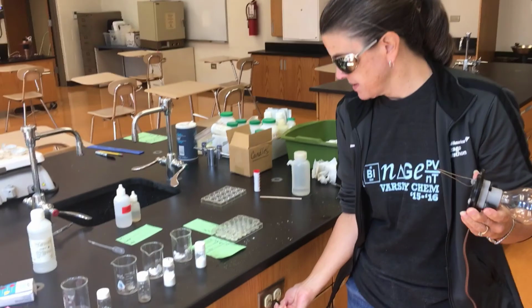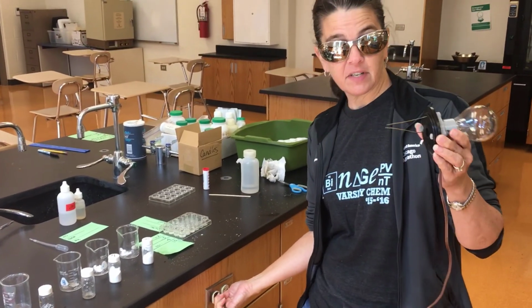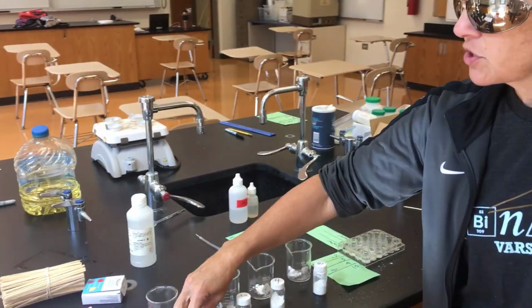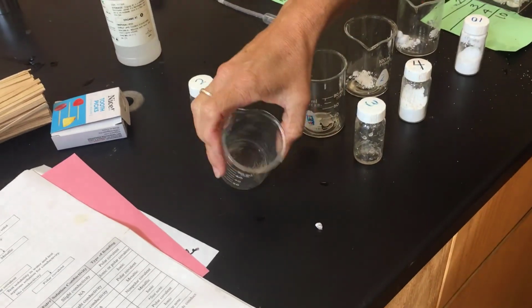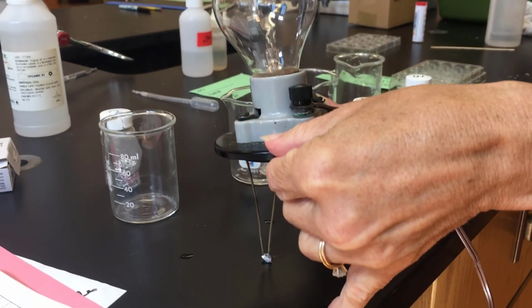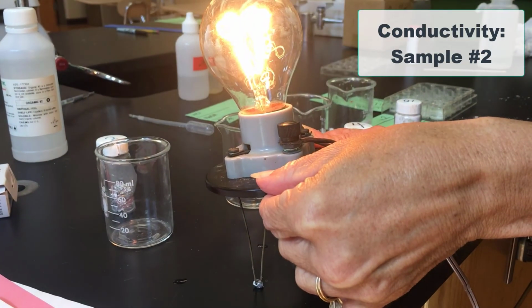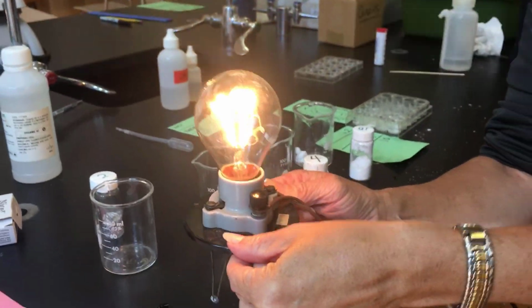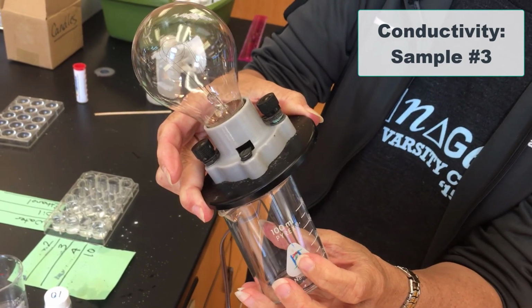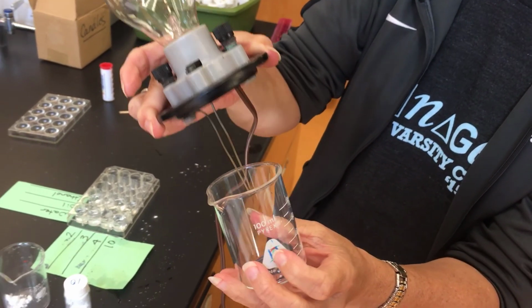All right, so now we're going to go back to our conductivity test. And again, I have my probes that I'm very carefully not touching. And so we're going to start with sample 2, which for this one I actually need to take out of its beaker so that I can aim. And let's see if I can get this onto there we go. So we do clearly have conductivity. Okay. This is sample 3. And I very clearly don't have conductivity.